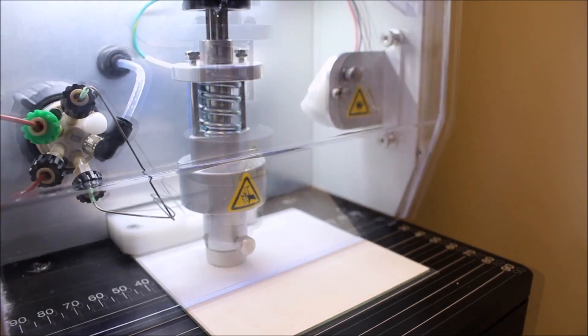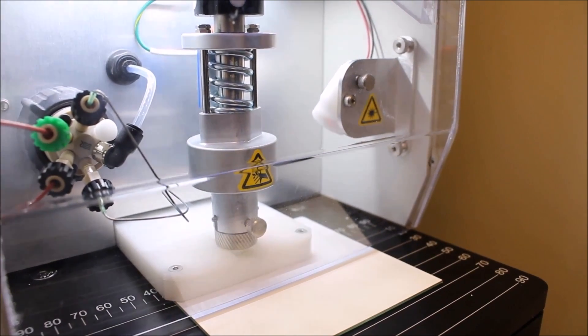Unlike LC-MS, where the mass spec is occupied for the entire duration of the chromatography, TLC-MS is much faster because the separations have already been done.